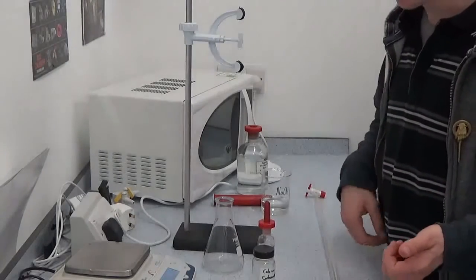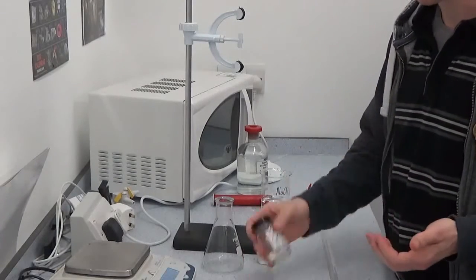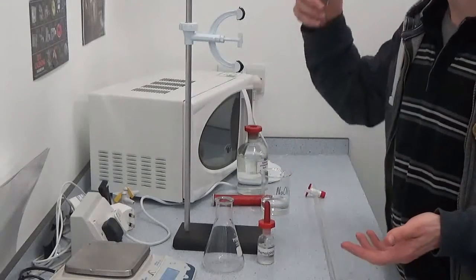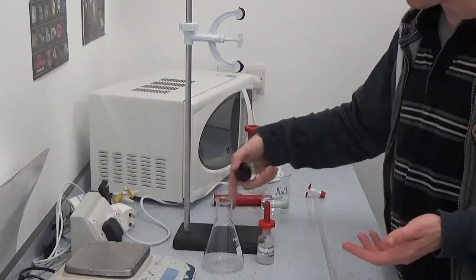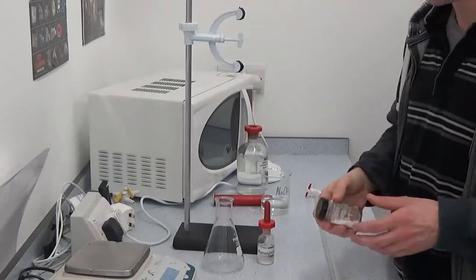We're going to look at a back titration. We do a back titration rather than a normal titration when we've got a substance which may be insoluble, the end point might be unclear, or it might react with the titrant too slowly.